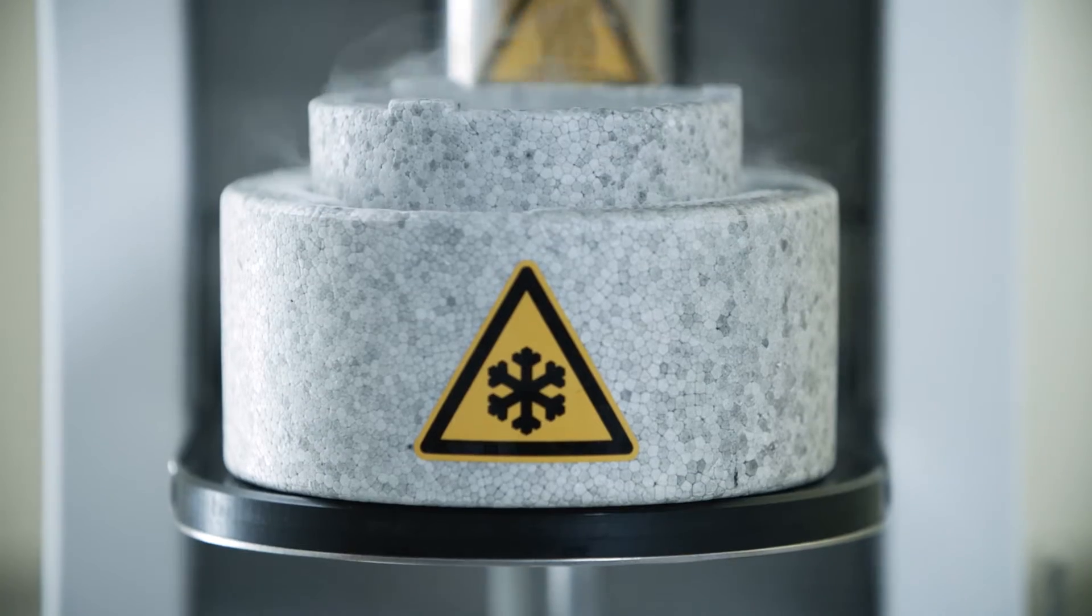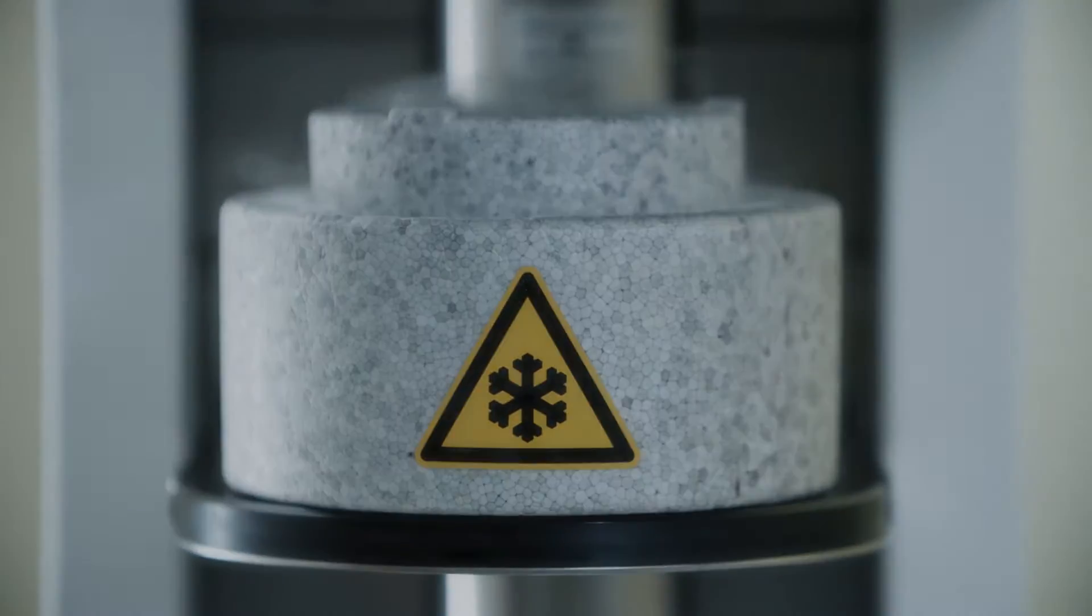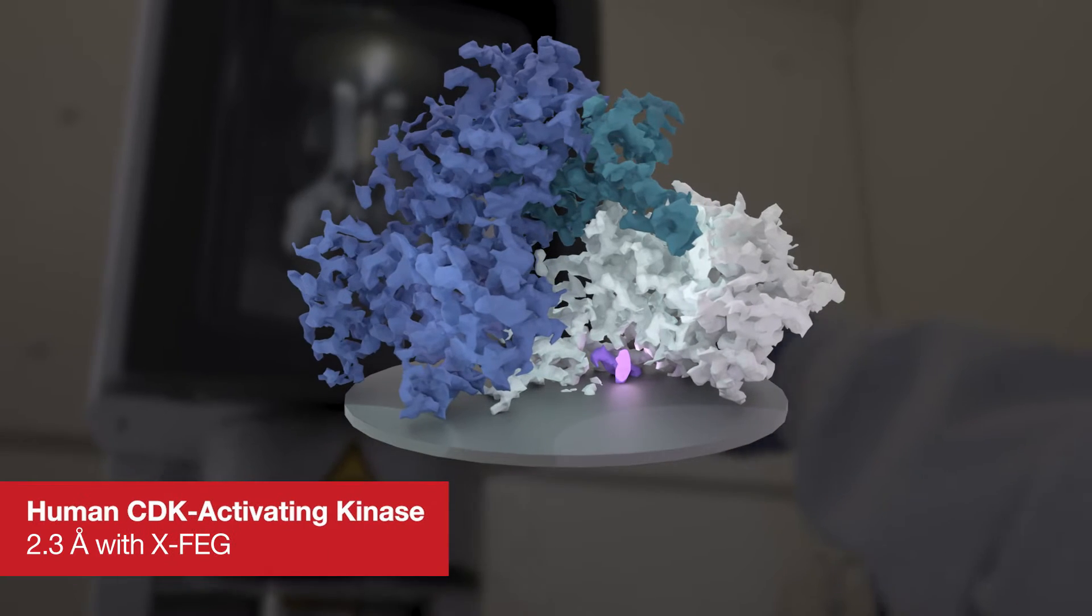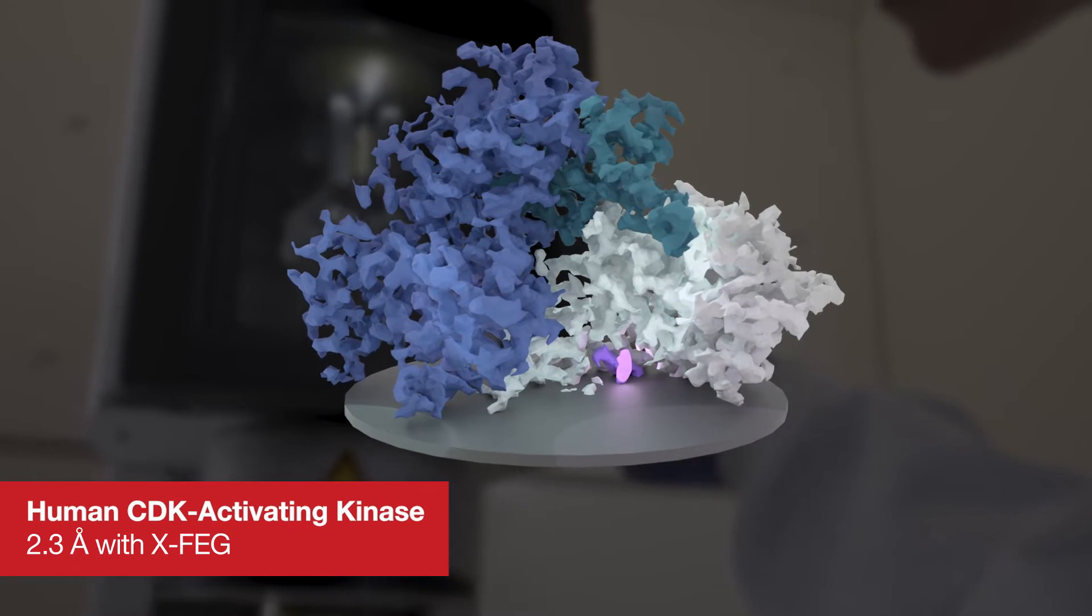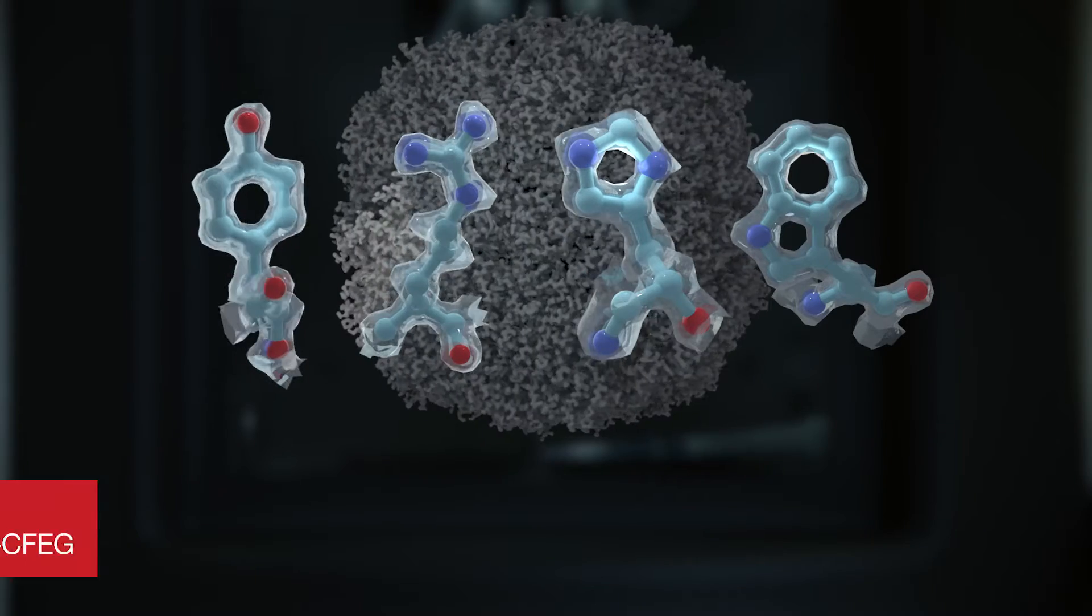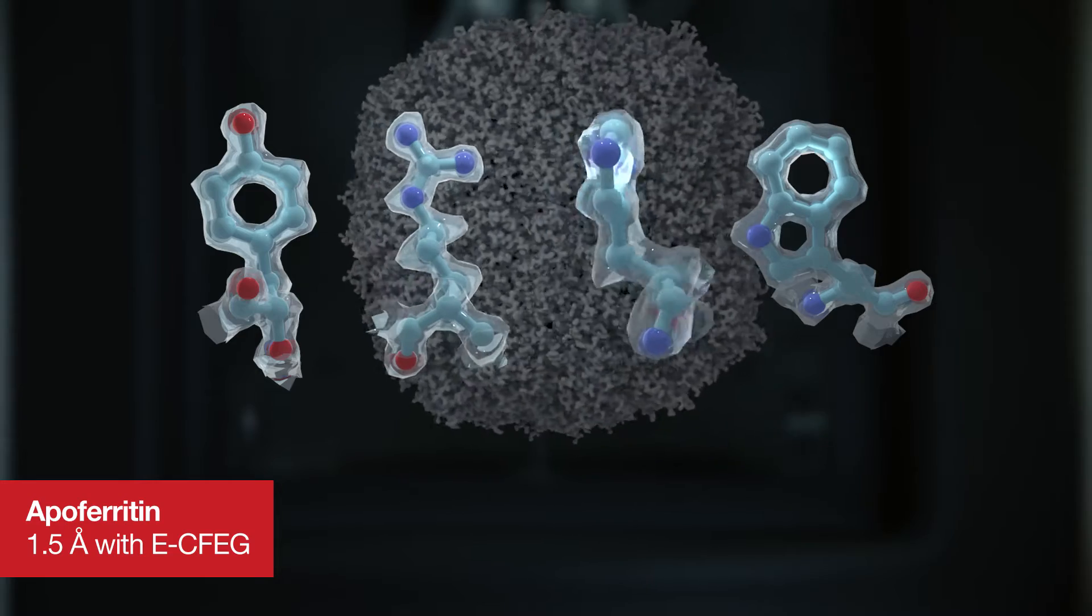Cryoelectron microscopy has revolutionized structural biology, giving researchers new insights into disease, helping them develop novel medicines, and enabling a better understanding of life's architecture.